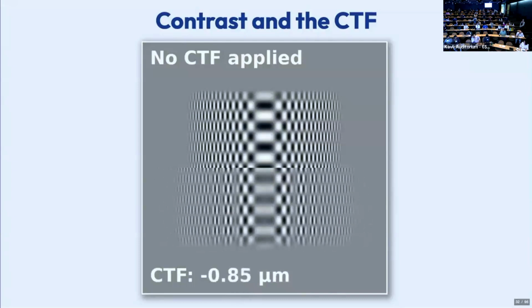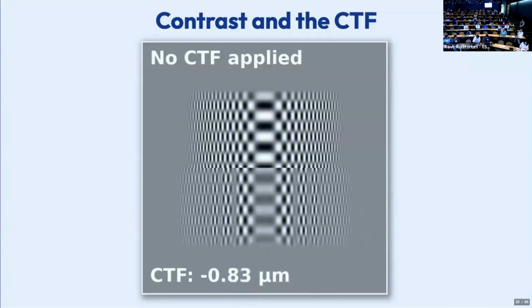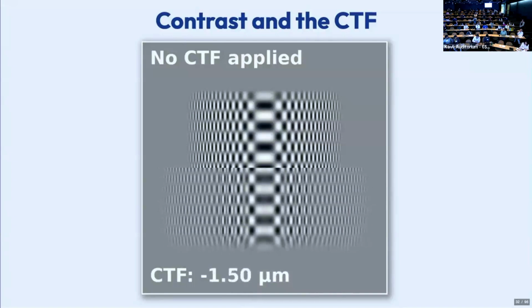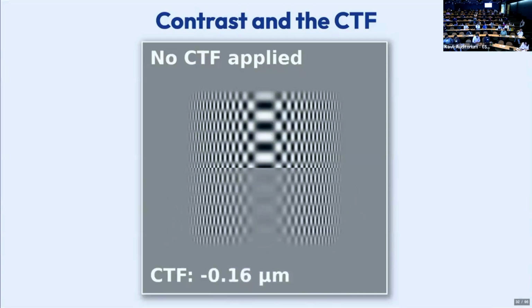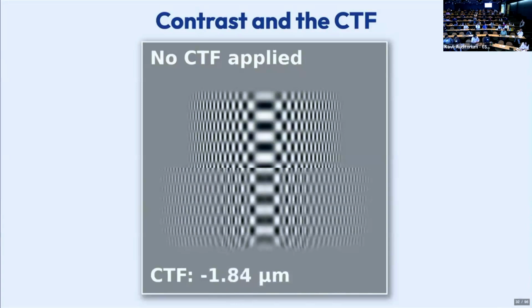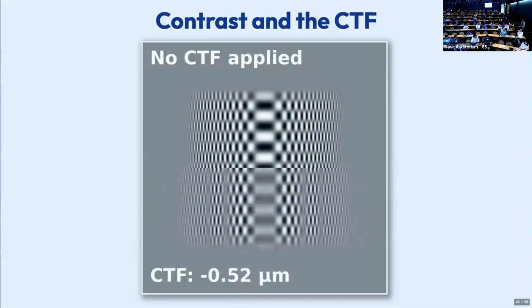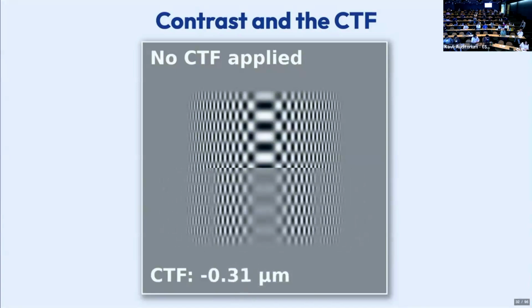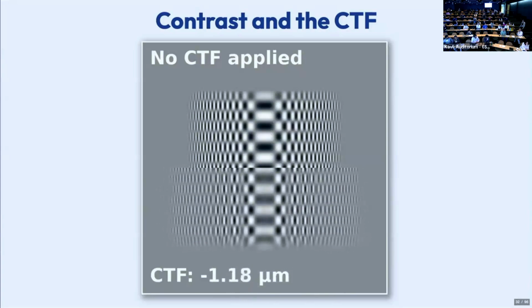That's one answer. The other is, in the old days, we have done a lot of radiation damage study of biological samples using protein crystals. So a lot of these so-called critical doses are based on those studies. And so you can actually do an experiment yourself by dosing it differently. And the one good thing about using the direct electron detectors is you have multiple frames.